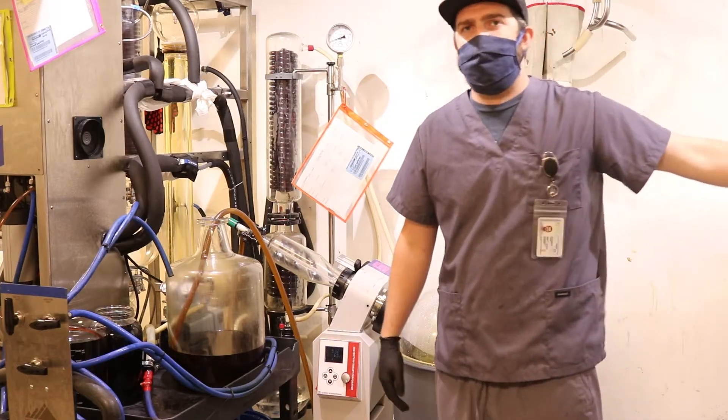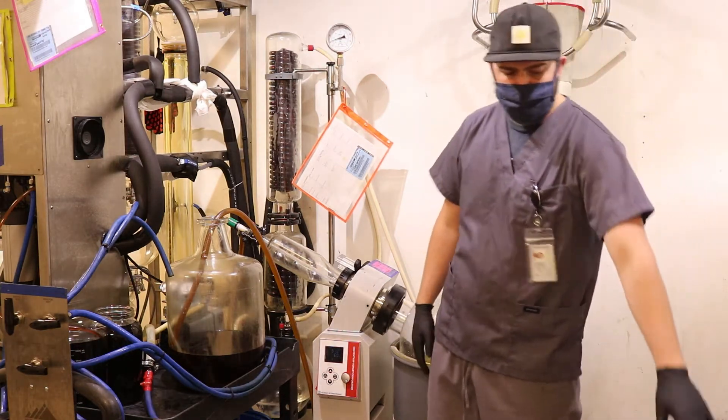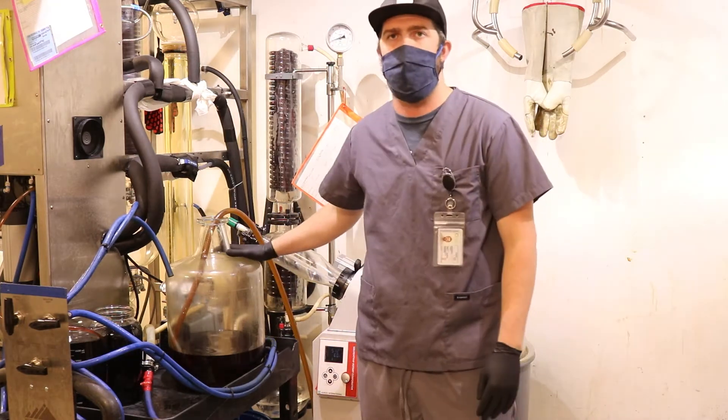So after it's been extracted, we then begin the distillation process. We will pull the extract from this keg through a series of strain filters to remove sediment. It will then end up in this carboy.